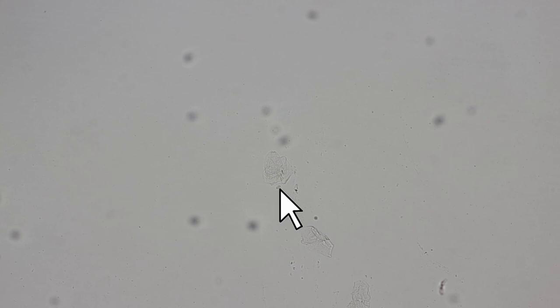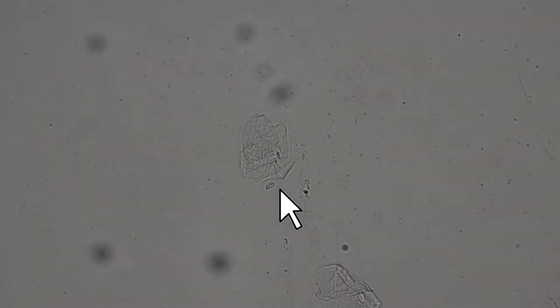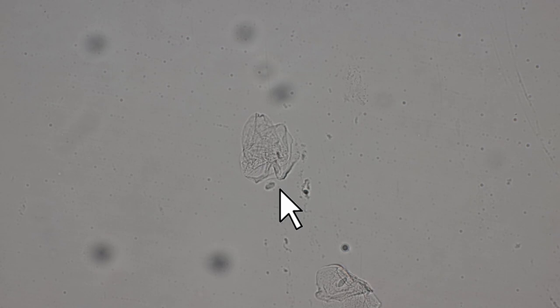So I'm going to move. This is the 20 times objective. Now this is the 40 times. I have to also adjust the condenser. Here we go. Of course, the higher we go up with the magnification, the darker the image becomes. I now set the camera to manual exposure, therefore the camera does not adjust the exposure. But I think you get the point.